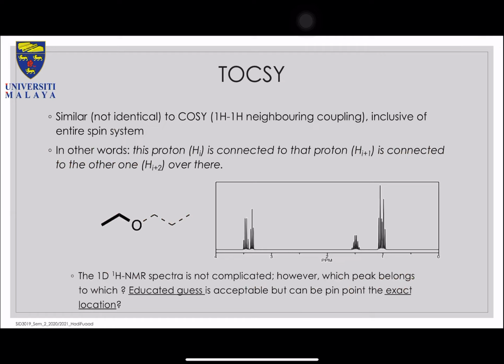So you will see, in this case, for example, this proton over here, okay, so imagine if that is protons, just for simplicity's sake, I'll just draw one proton per carbon. So if you're looking at this proton, you can actually see it is coupled to that proton. Additionally, you can see that this second proton is coupled to that proton, but you will not see this proton and that proton.